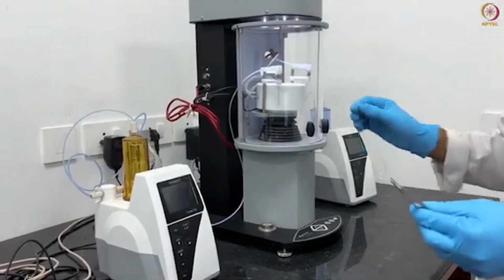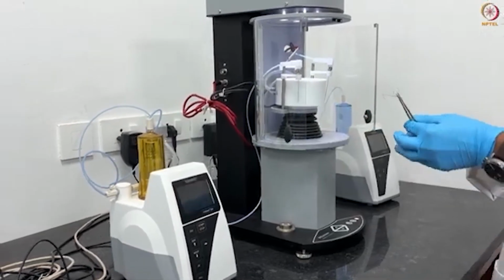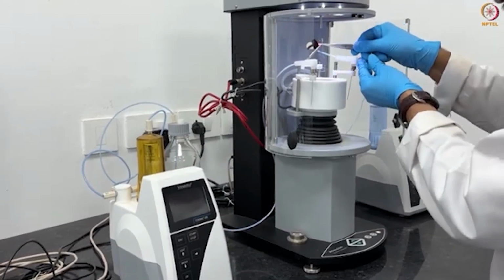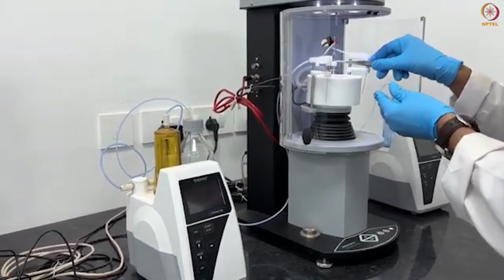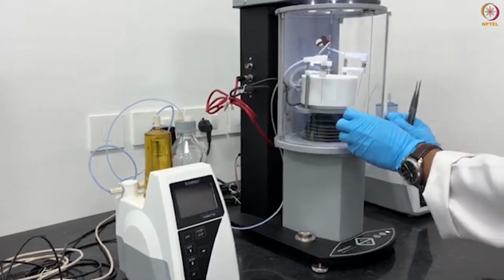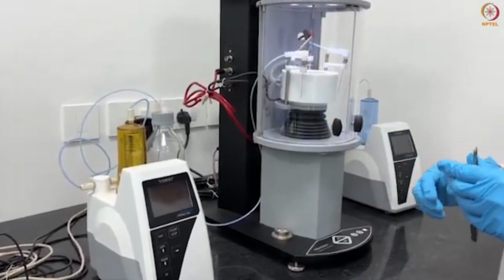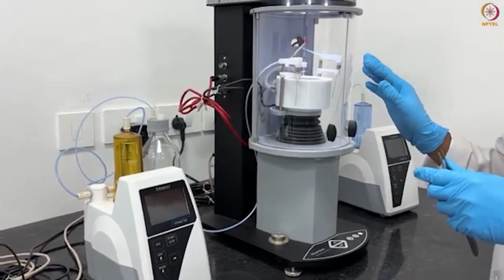Let us carefully place our ring on the balance. Remember, this step should not cause much movement in the system. Now, let's close the system. You can see here that our Du Noüy ring is ready for the measurement. Notice the significant difference between the Du Noüy ring and the sample.